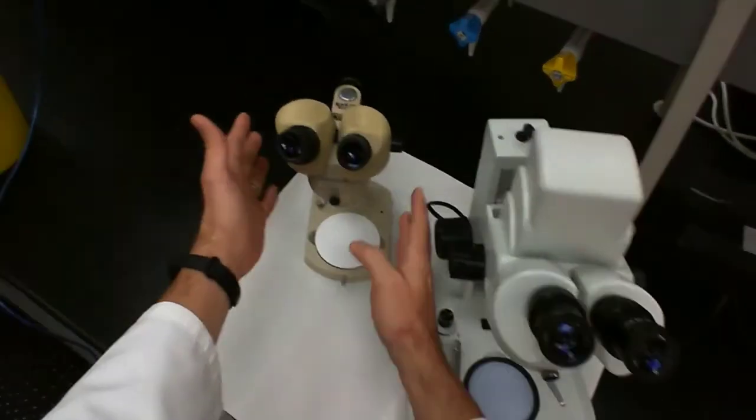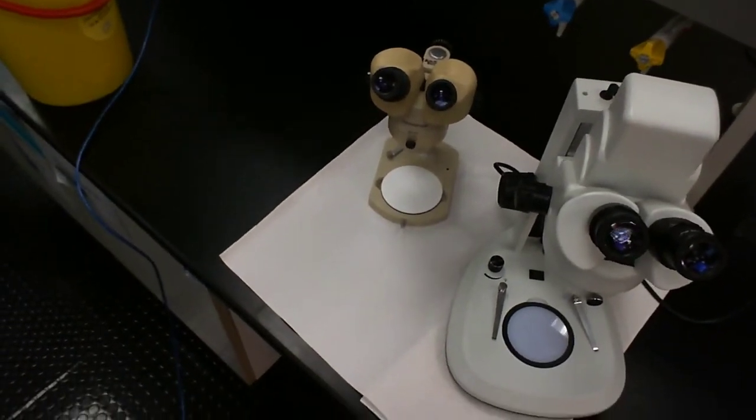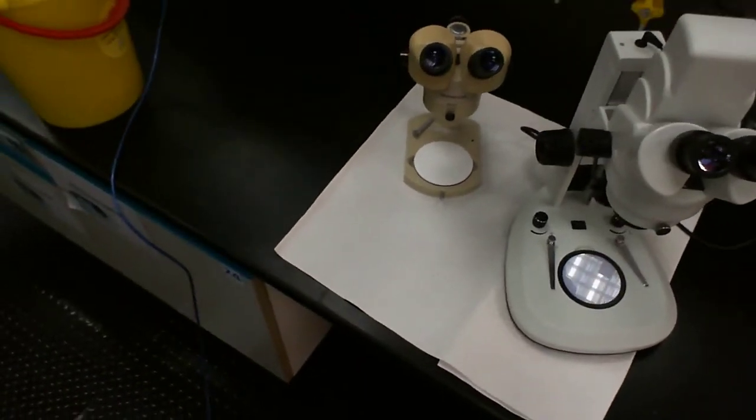Whereas this is an older model, slightly less fancy, but still works quite well. What they have in common is that the same basic structural features are present.